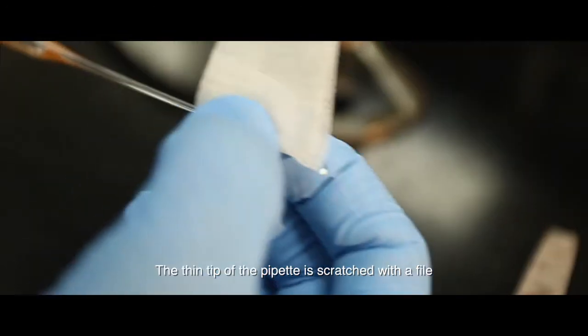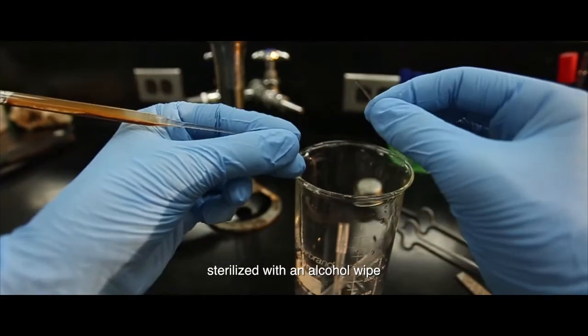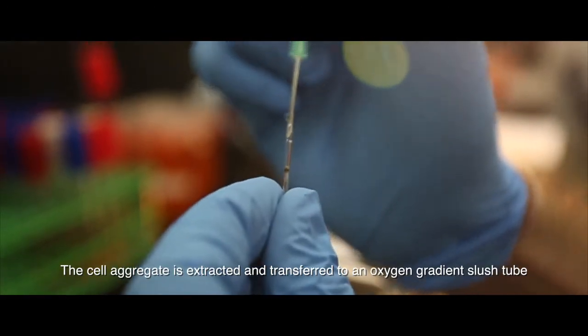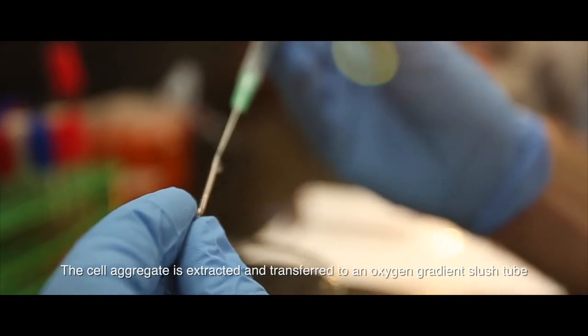The thin tip of the pipette is scratched with a file, sterilized with an alcohol wipe, then broken. The cell aggregate is extracted and transferred to an oxygen gradient slush tube.